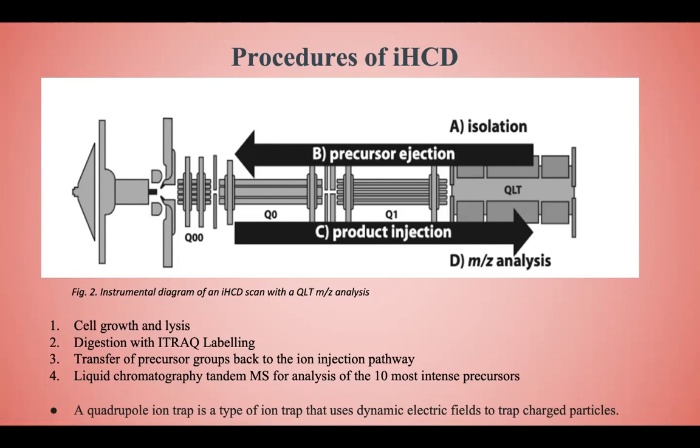Then liquid chromatography tandem mass spec is done, and the 10 most intense precursors were selected for data-dependent activation using IHCD.